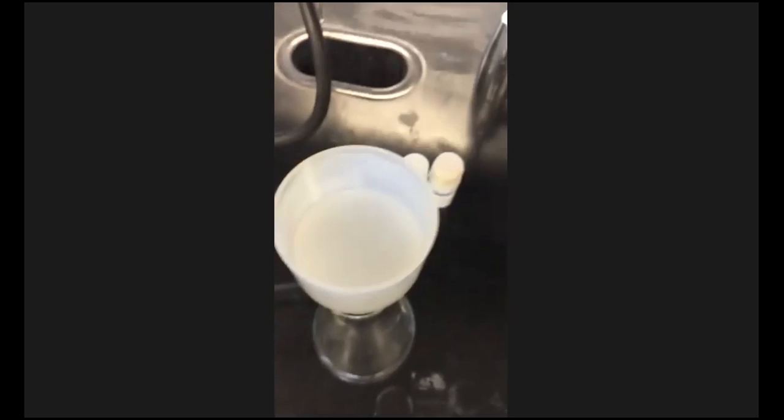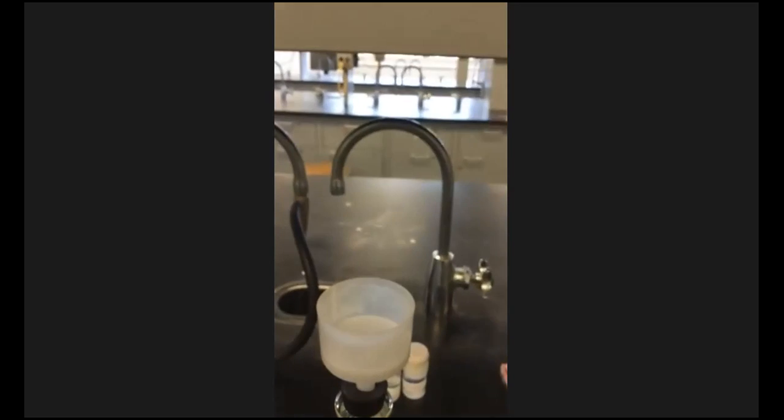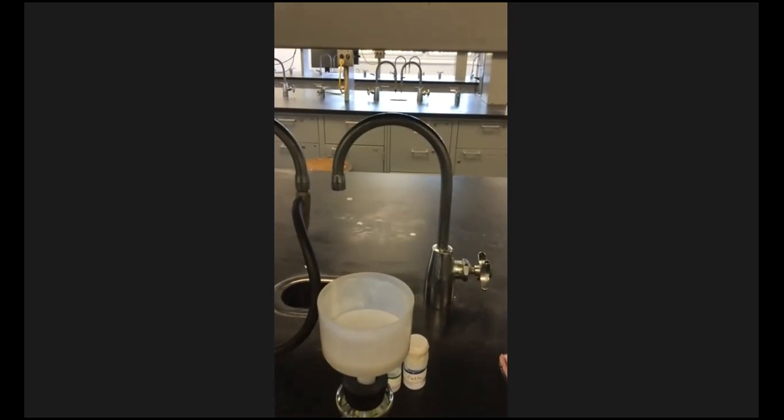That's important because one of the biggest mistakes that you can make when you're doing a filtration is to allow your product to go over the sides of the filter paper. So you don't want to do that. So you want to keep that filter paper seated so that nothing can get over the sides. All right. And how much time we got left? So we got 4 minutes left before we can do the next step.